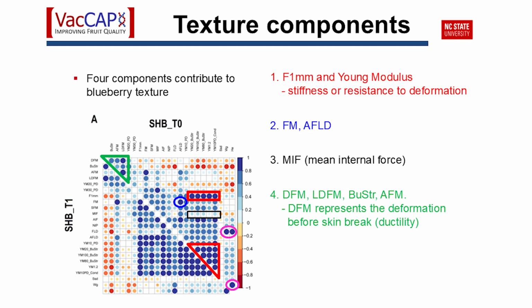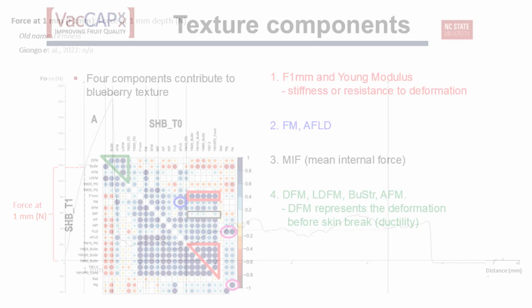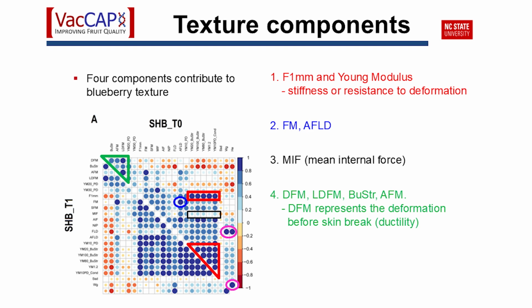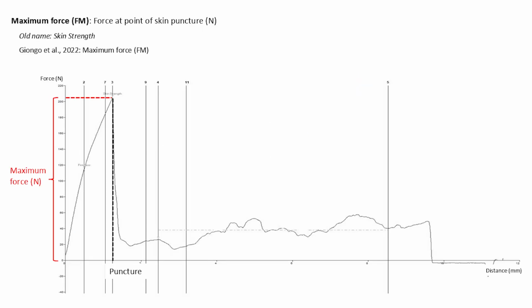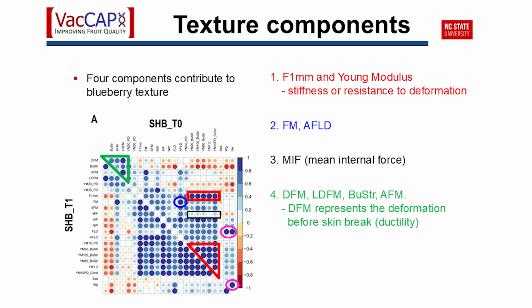There seems to be mainly 4 components that contribute to blueberry texture. The first one includes force at 1 millimeter, which is the force recorded at 1 millimeter depth, and Young's modulus. These parameters measure the stiffness or resistance to the deformation of the berry. The second component is maximum force, or FM, and this is the force recorded at the maximum peak where the skin breaks.